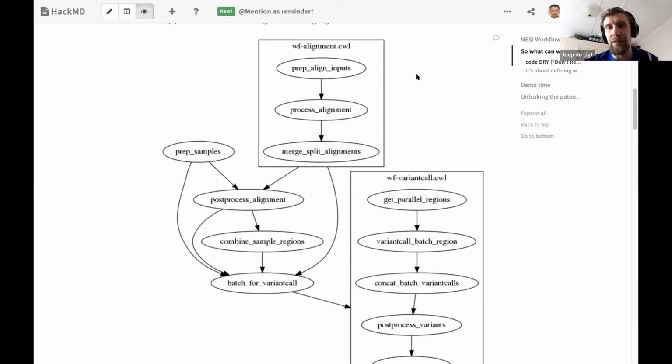If you're talking about an alignment and variant calling set, there's things like the Genome in a Bottle if you're working with humans, but other well-published genomes if you're working with a different species, that can give you a set where you evaluate the performance or the actual accuracy of the pipeline based on a sort of silver or gold standard of data. So that's how you typically evaluate these types of pipelines.